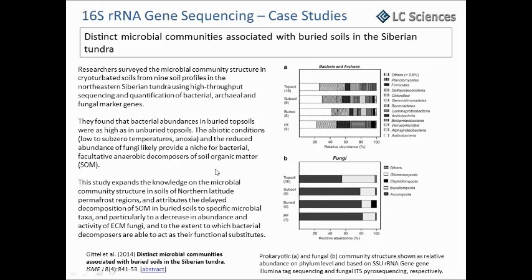They become abundant, and they are functionally well suited to decompose the soil organic matter inside. So they used the 16S method to find out the distribution of the different microorganisms inside the soil.